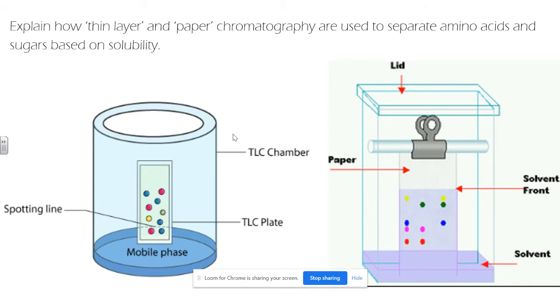During the run, the mobile solvent will move up the plate quicker than the dissolved sample. So to quantify the results, the distance traveled by the substance being considered is divided by the total distance traveled by the mobile phase, the solvent. This ratio is called the RF value.